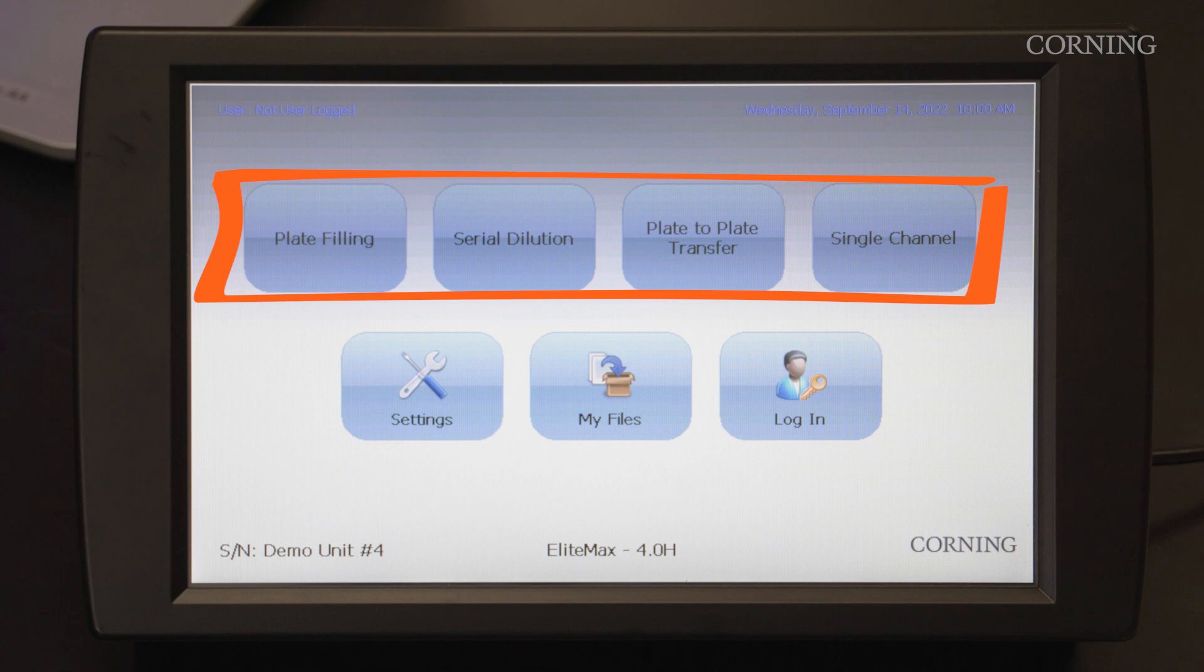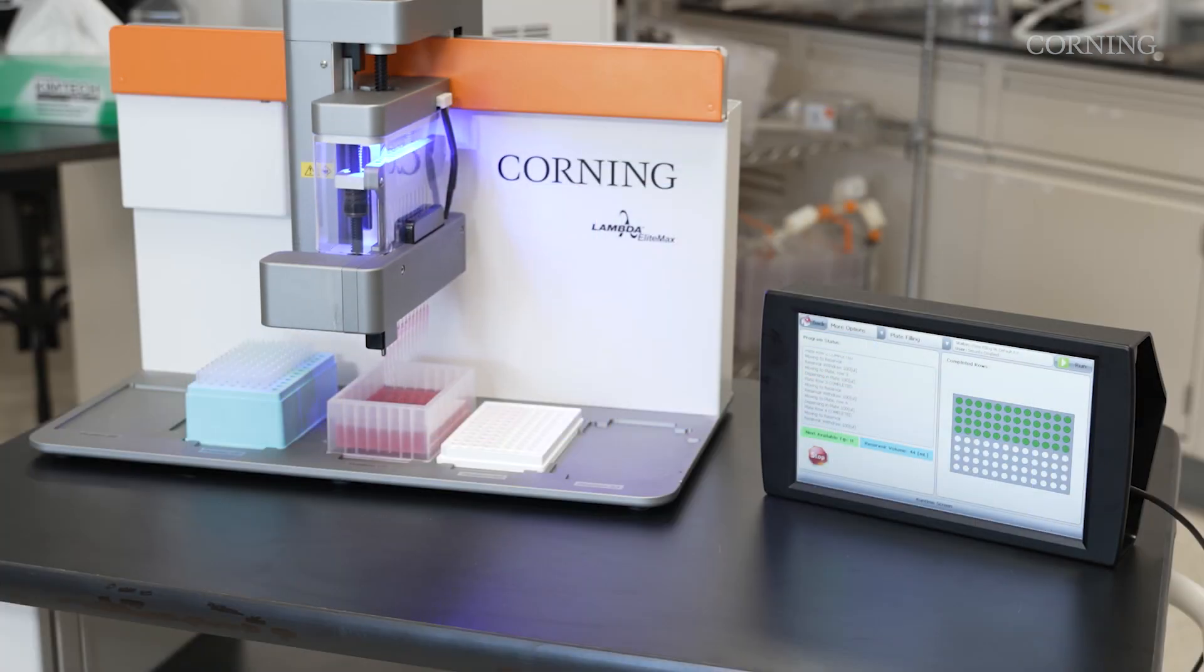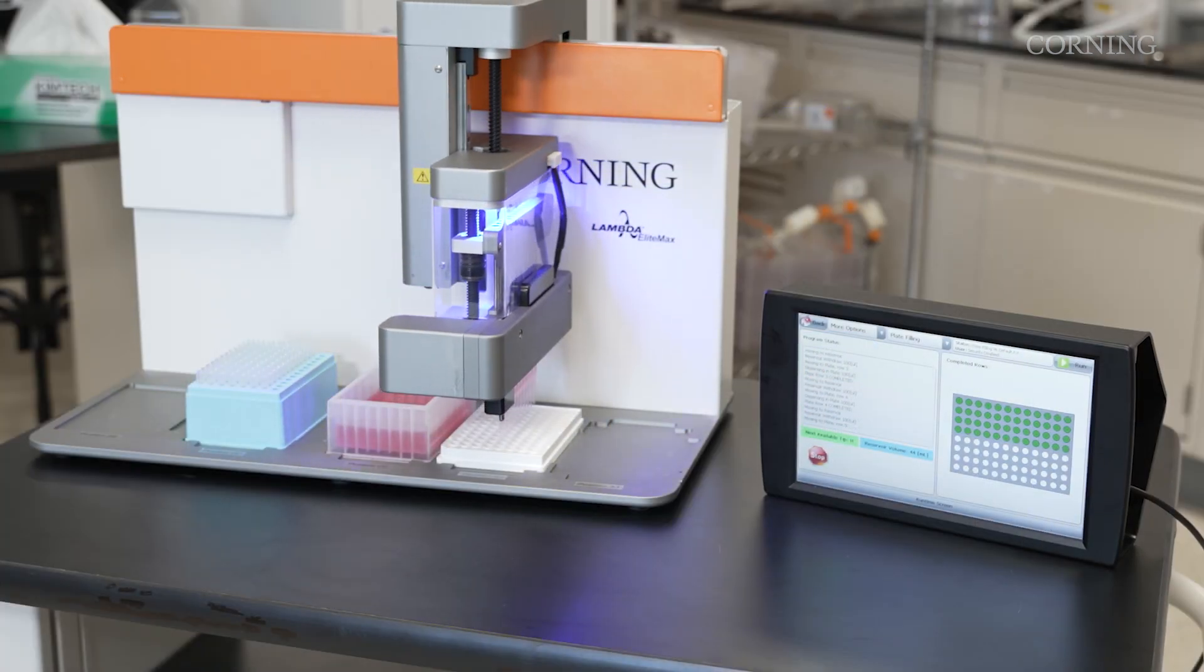It is an ideal solution for complex applications such as sample preparation, timed reaction, PCR preparation, cell-based assays setup, and more. Check out the different protocols in the remaining videos.